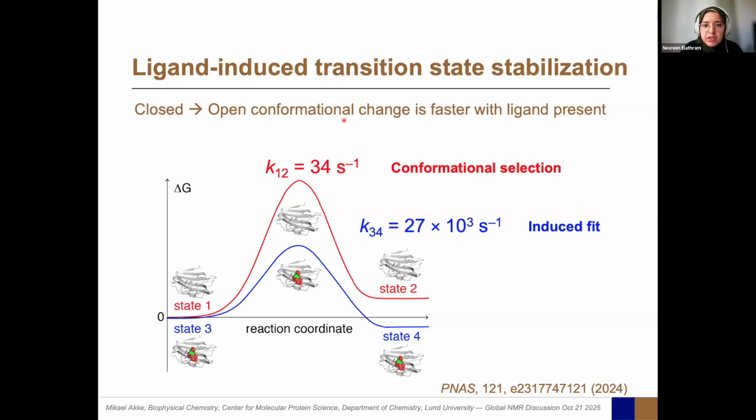Okay. Actually, we have a last question right now, or maybe two. CPMG of the nitrogen group or side chain methyl group, it seems that ligand binding does not cause backbone deviation severely. Sorry, I don't get it. What's the question? Like CPMG of nitrogen group or side chain group. Maybe did you do those?